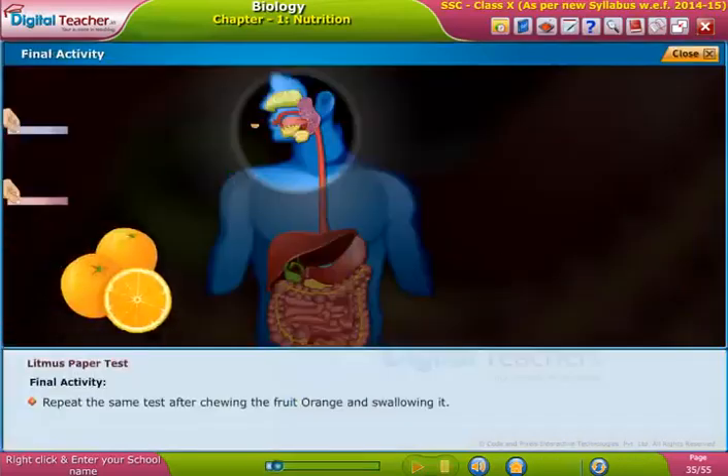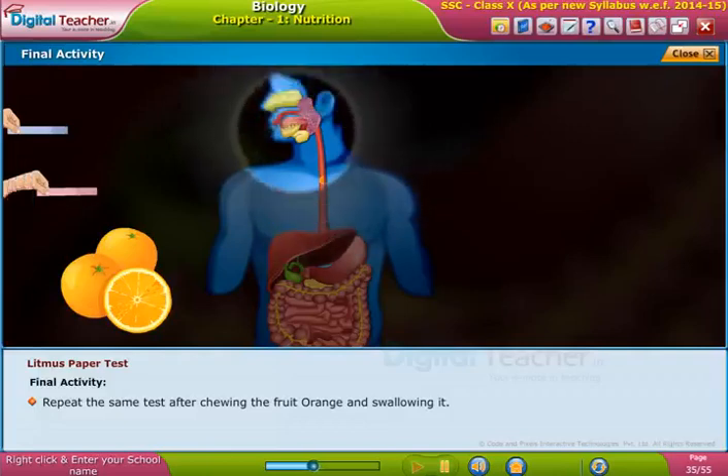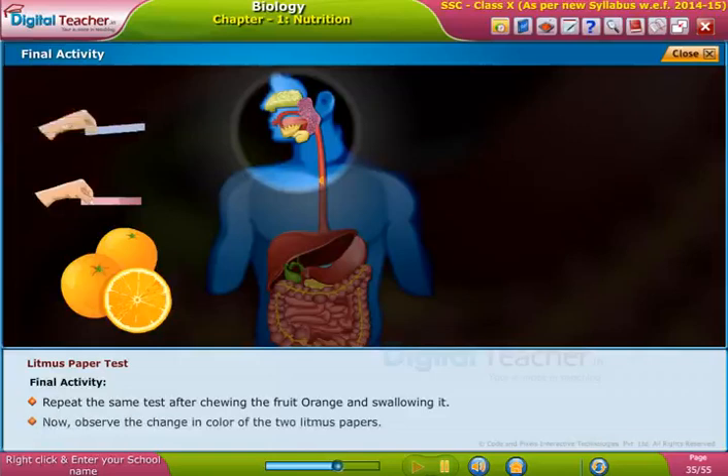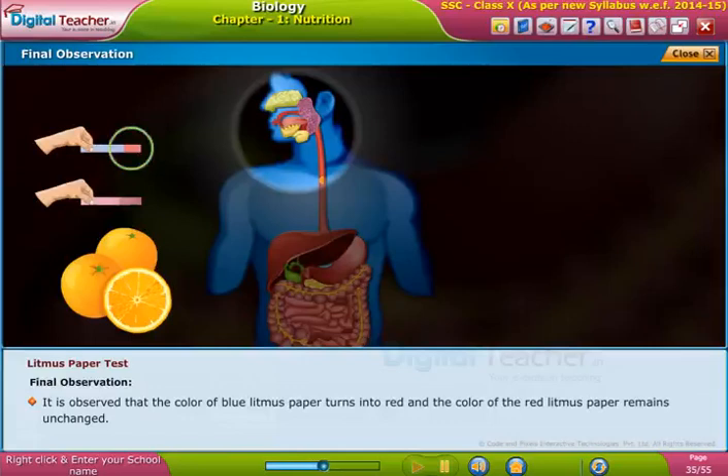Now let us do an activity to learn about the nature of our saliva after chewing the food. Repeat the same test after chewing the food orange and swallowing it. It is observed that the color of the blue litmus paper turns into red, and the color of the red litmus paper remains unchanged.